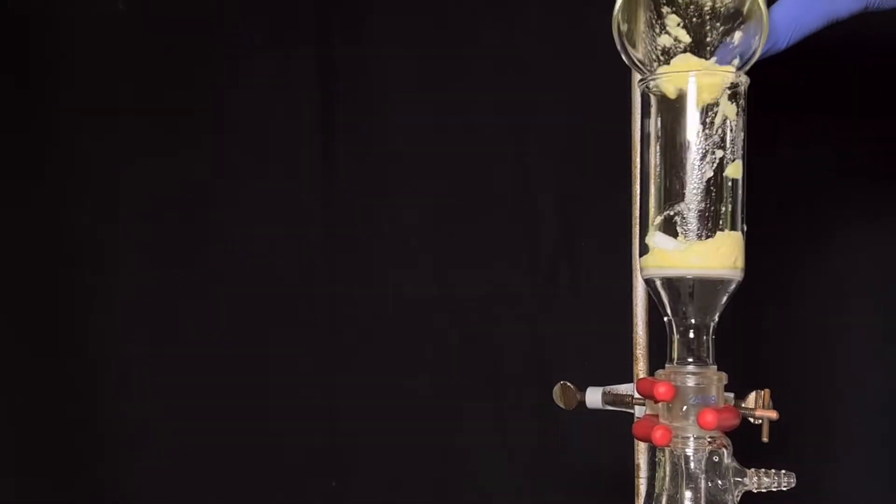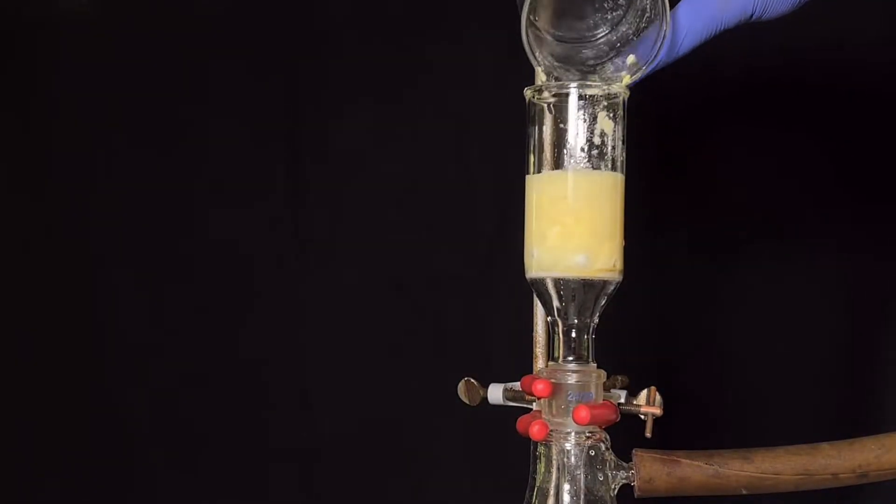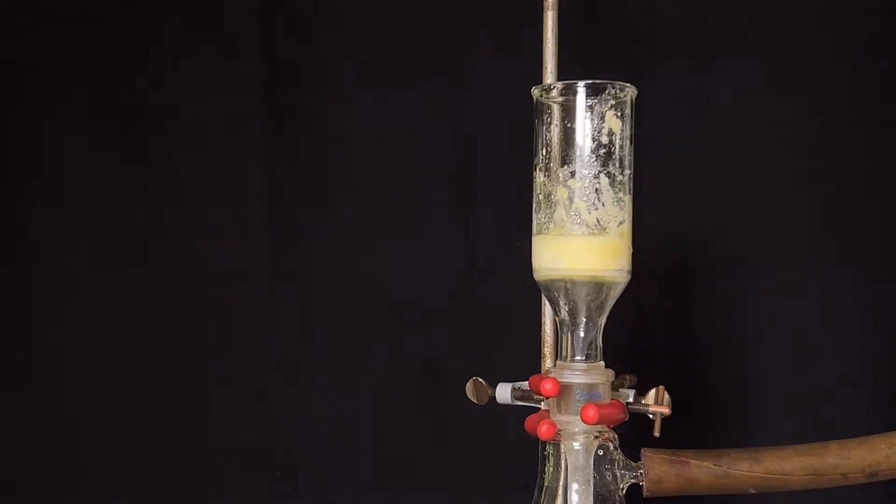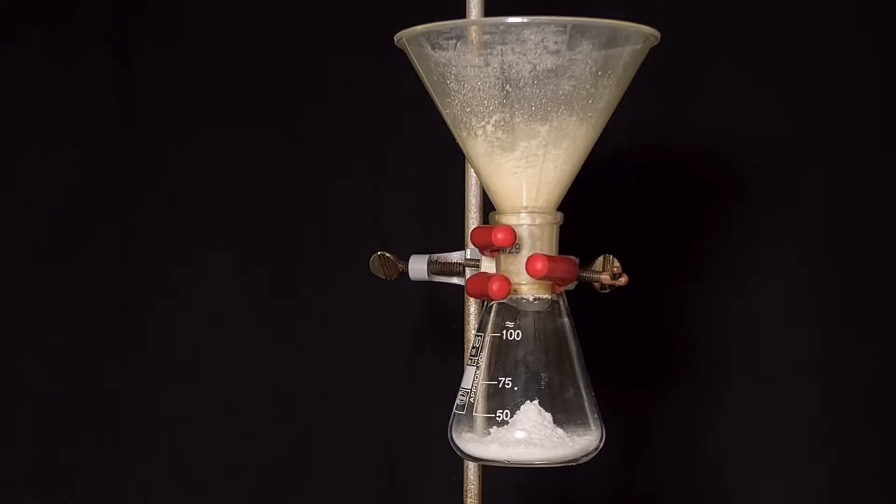The solid was then filtered. Here I am using vacuum filtration with a glass Buchner funnel. The crude solid was then washed with around 10 milliliters of cold ethanol. After washing with ethanol, we have a white solid. Vacuum was kept turned on for around 5 minutes to dry the product as much as possible.